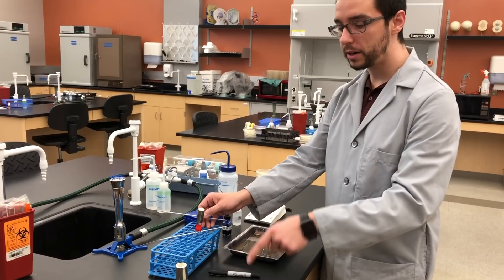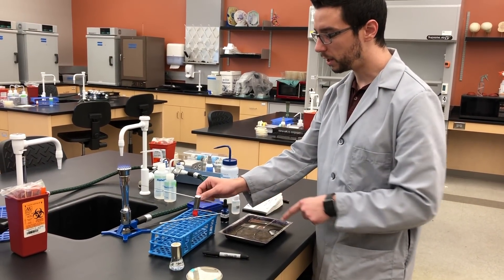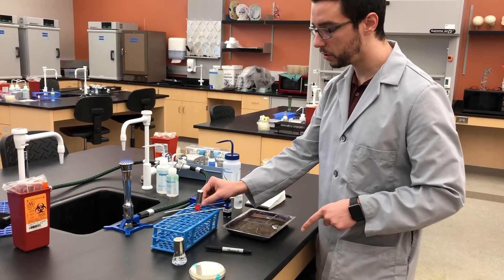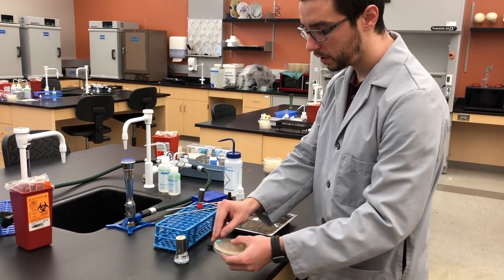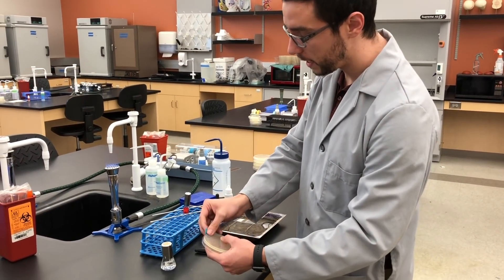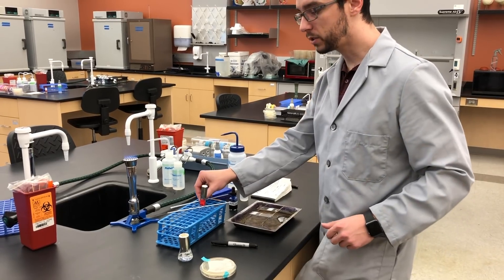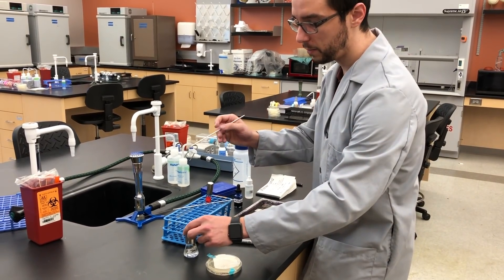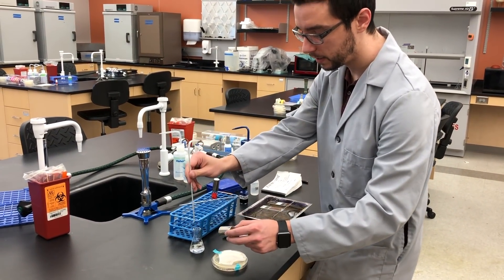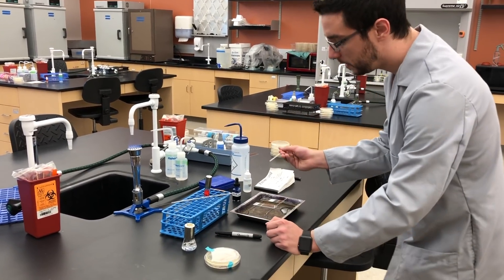Then we're going to use the loop to transfer water from this sterile deionized water and put a little bit on our slide and spread it out. That's where we're going to add our culture from the plate in just a little bit. While this is finished cooling, I'm going to go ahead and open up our plate so it's ready.